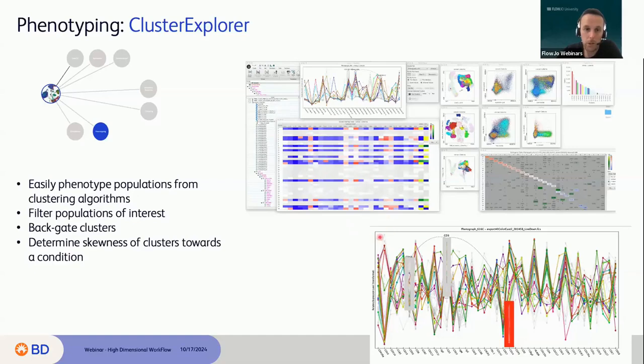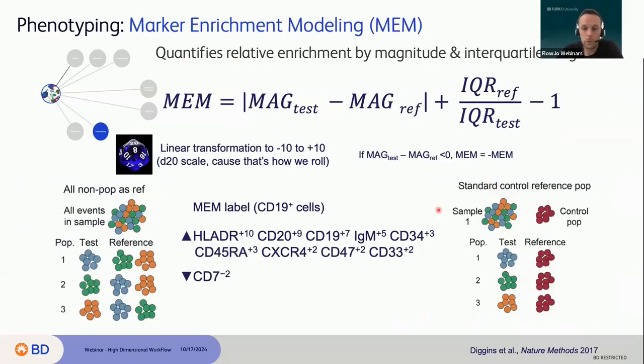that matches those criteria. And after, you can look with your heat map or your graph line at the difference between each of those clusters, and rename each cluster with a biological name. So, okay, activated monocytes, non-activated monocytes, for example, or my Tregs, or whatever cell population you have. So that's a manual way to define all your clusters.